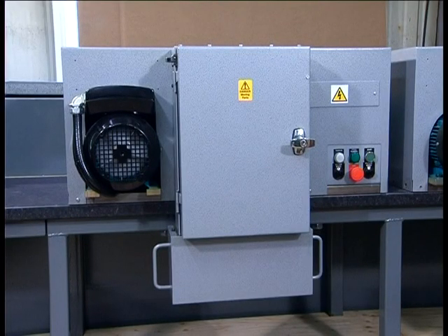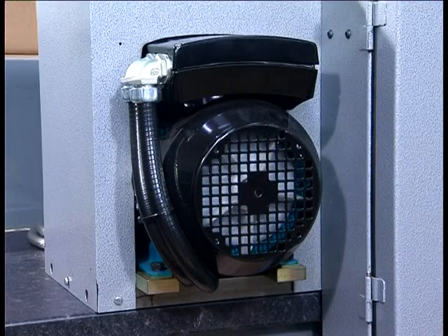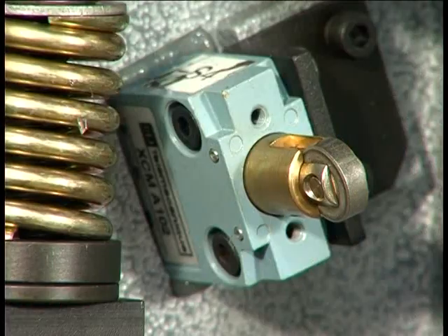Our Charpy and Izod specimen machine is of compact design and enables test houses and laboratories to manufacture their own 10mm square Charpy and Izod samples without having to rely on functions outside their own control, such as machine shops.